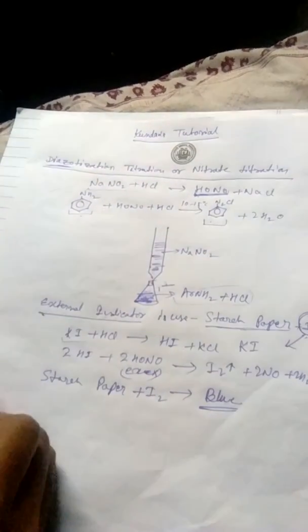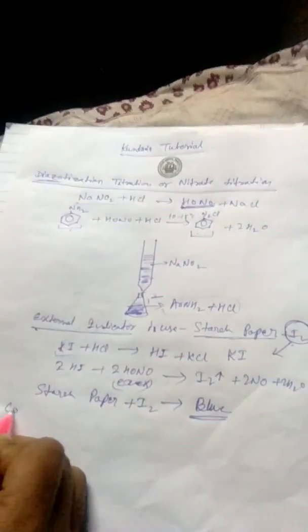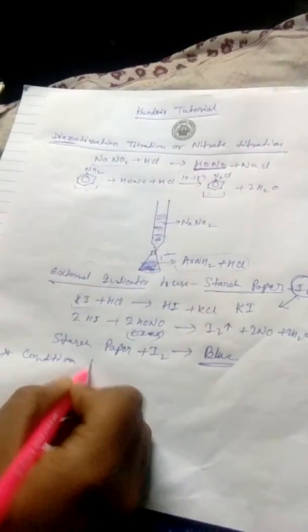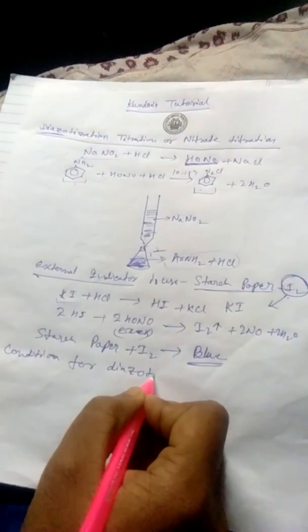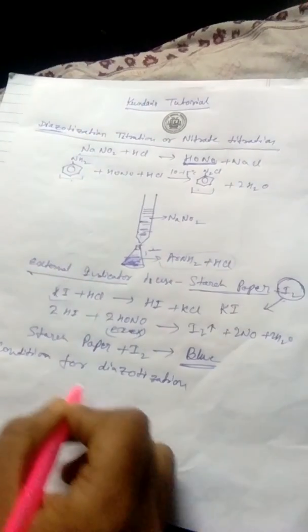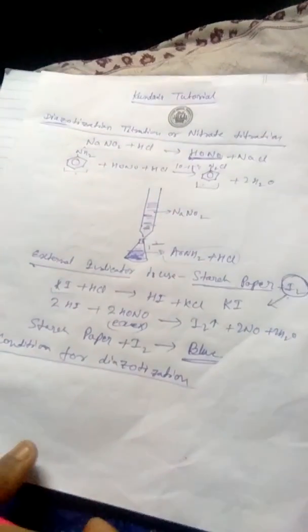And the next point we will see is the conditions for diazotization.